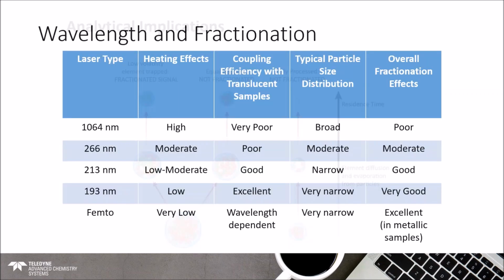Okay. And then just as one final piece on this, I think this slide does a really nice job of pointing out the different wavelengths and the advantages or challenges with any of them. You'll notice as you go lower and lower with the wavelength, your heating effects fall off, which of course is our goal, unless we're, as I said, using a 1064 for the intent of heating.